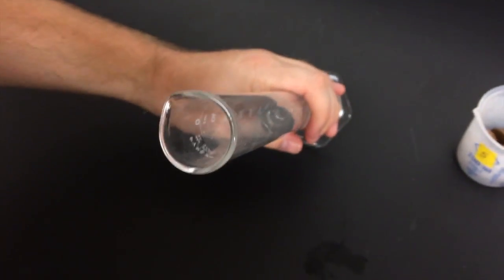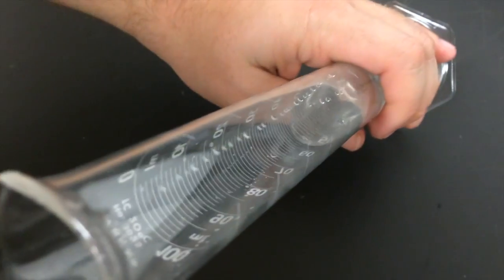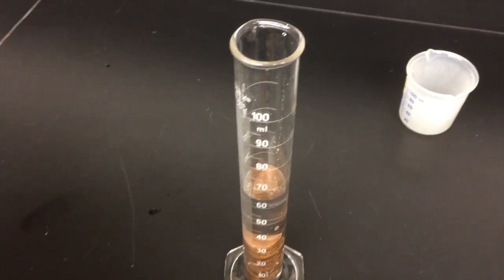This portion works really well if you have a lab partner hold the cylinder at about a 45 degree angle while you slide pennies down the cylinder, as you can see here. This works to reduce the water splash that you see and also losing water out of the cylinder.